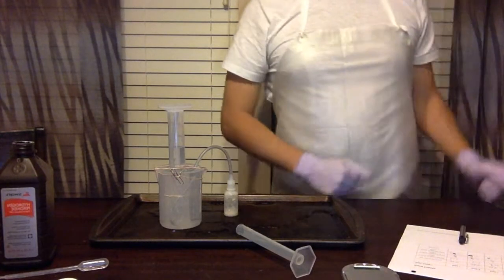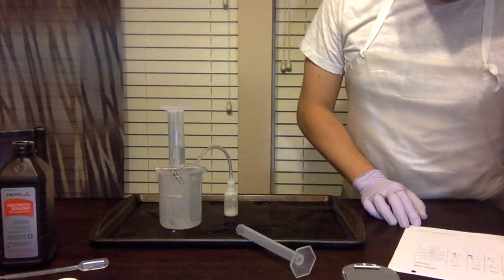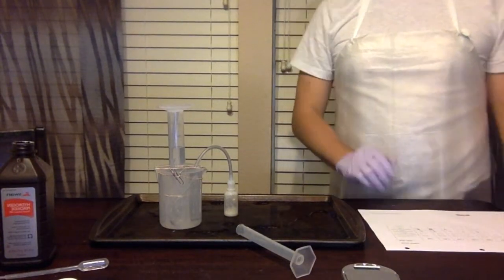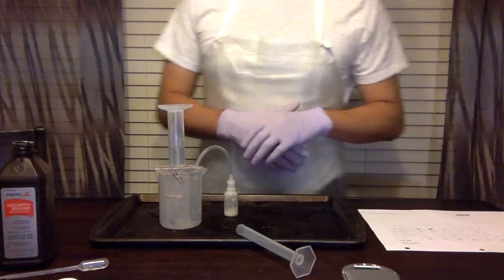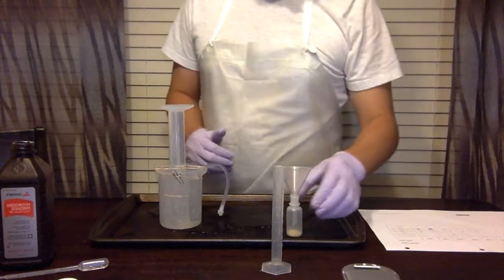We'll give it a couple of seconds, but it looks like we stopped at 26 milliliters. Yep, we have stopped at 26 milliliters. We'll be back to commence trial number 6. All right, we are commencing trial number 6.